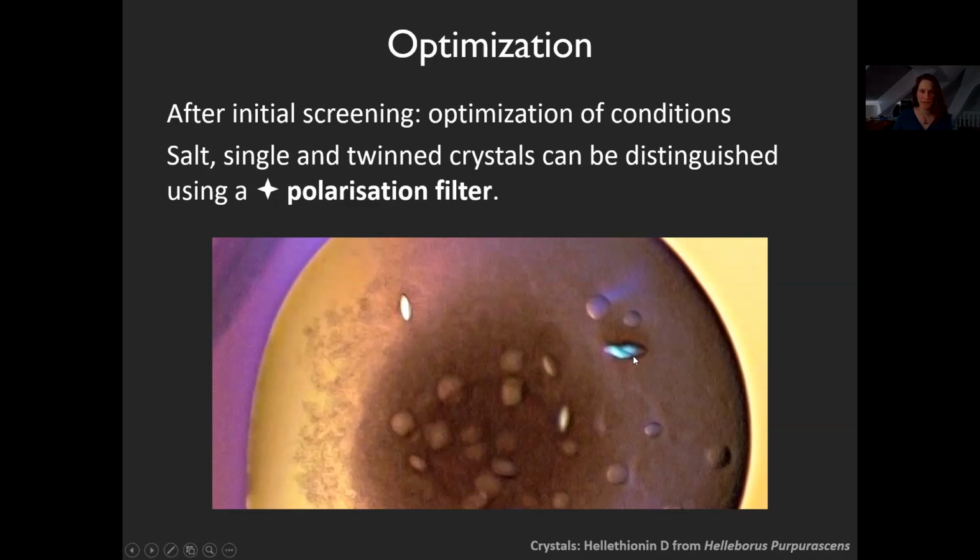At least it was something enantiomeric that rotated the polarized light. So these were actually protein crystals that again diffracted to 1.8 angstrom resolution, although they don't even have nice edges. Goes to show ugly crystals can still give you beautiful data sets in protein crystallography.